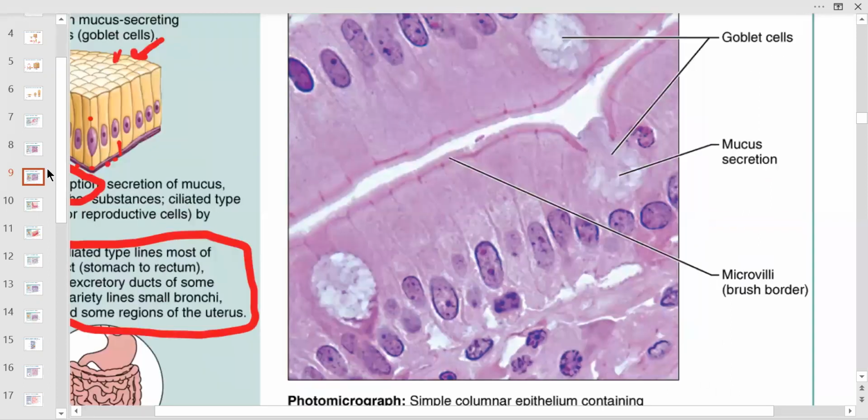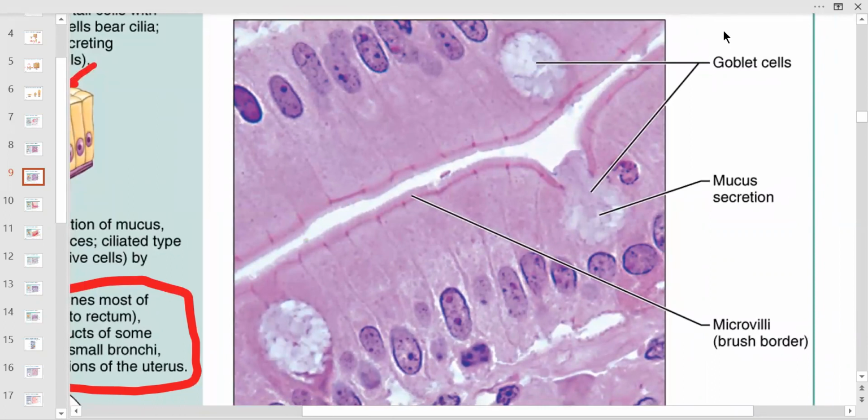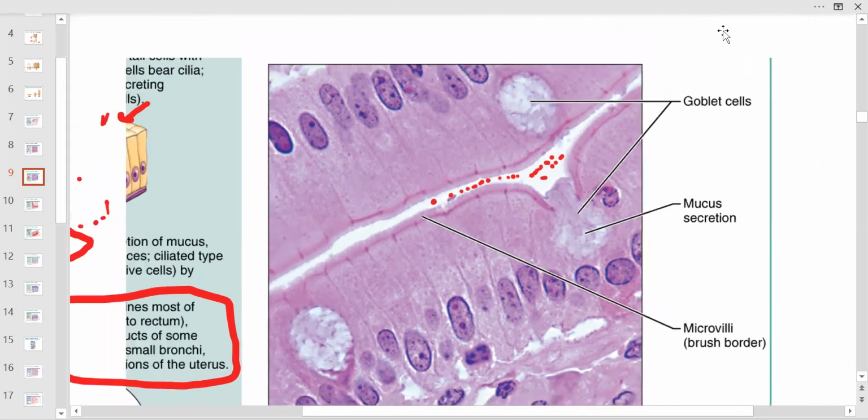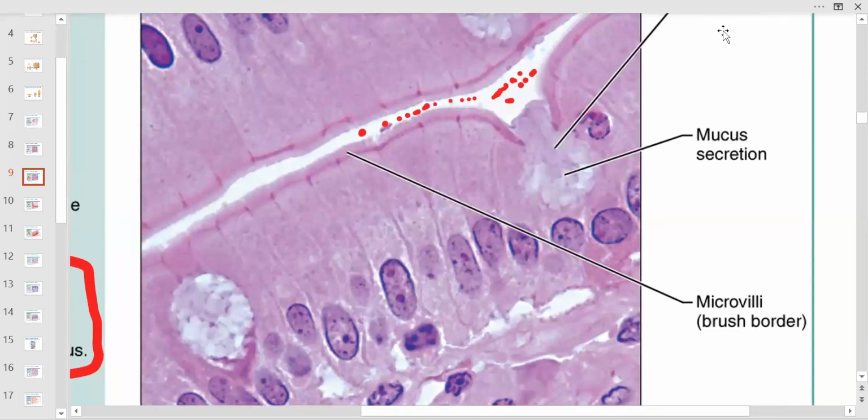Let's go to the real histology of this tissue. I don't want to make it too big. So now we got, this is the lumen in here. This is where the chipotle is going through, right? The little beans, and it's broken down though. It's broken down to carbohydrates. Now it's like disaccharides at this point, amino acids maybe, right? So that's the lumen. This one's kind of tough to see a basement membrane. I don't see a good basement membrane. Maybe there is one. Maybe you could find one.